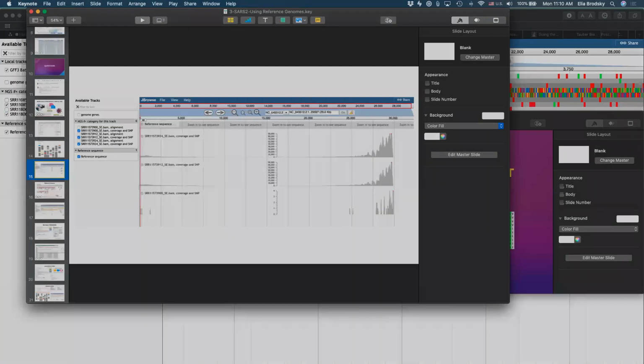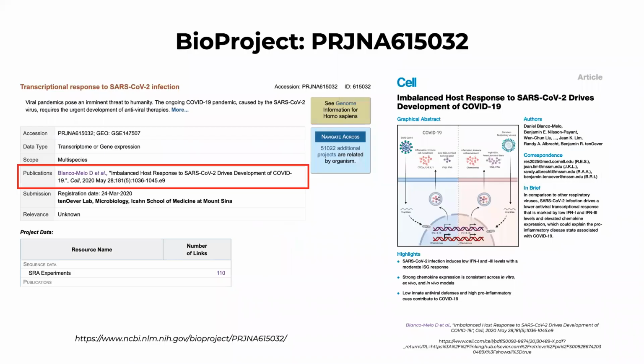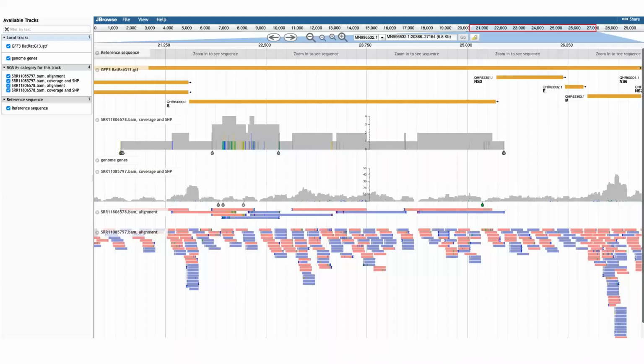Now, the number of reads here starts playing a major role, right? Because when we look at the specific sequence and we try to see how the sequence is related to the reference genome, just like we're seeing here, we need some evidence about the differences, right? Each difference that we find needs to be supported by some number of data points that will prove that this is a real variant.